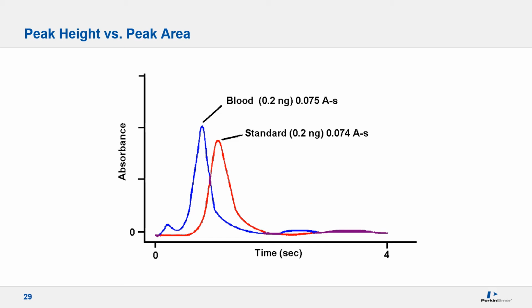The key point here is that if you are successfully able to completely transform the analyte to the ground state during the atomization step, it will not solely depend on the rate of formation, allowing the use of aqueous standards with more complex samples and still provide accurate results when using peak area quantitation.